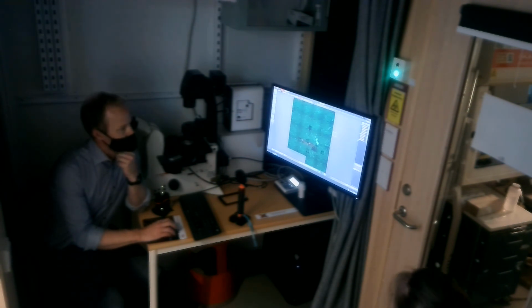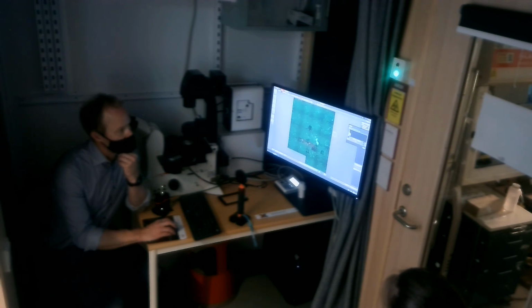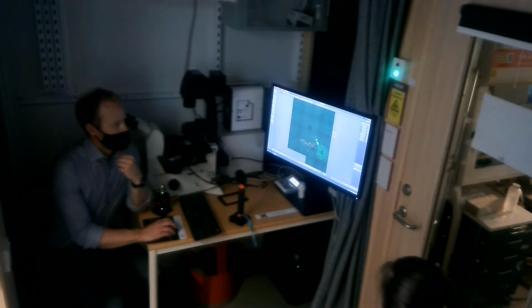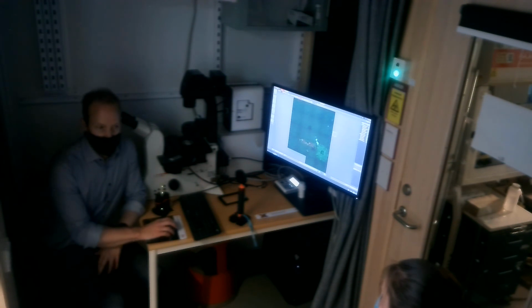You also have the possibility to go in to each preview here. Let me see if I can get. This is the big preview that we did. I can click on this little guy, and I can go in here and adjust the contrast of that specific preview with both color and contrast to see it better. So that's something that you have the option of doing. All of that is just to help you to see where you are and navigate around. But that possibility is there.